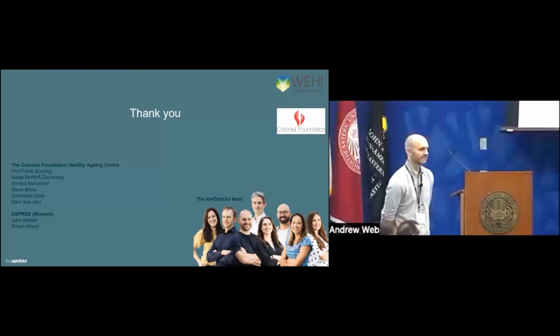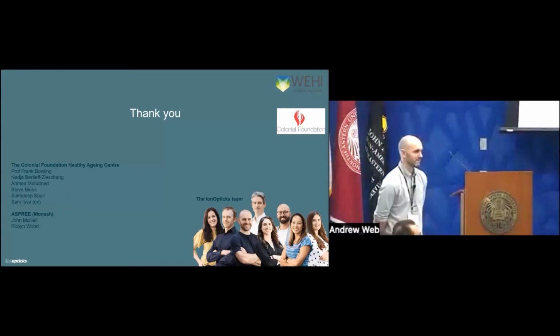Thank you. Excellent overview of that and vision for the future. How do you segue the extrapolation you're doing in your mind in the chromatography with the sample volumes and the autosampler and the sample preparation for single cells? Because one of the things we do, even when we're using nanoliter droplet size prep, is dilute the sample down to avoid matrix related effects, and it may be part of the lysis itself. And then you have all of this mechanics of getting the sample from where you've produced it to the column.